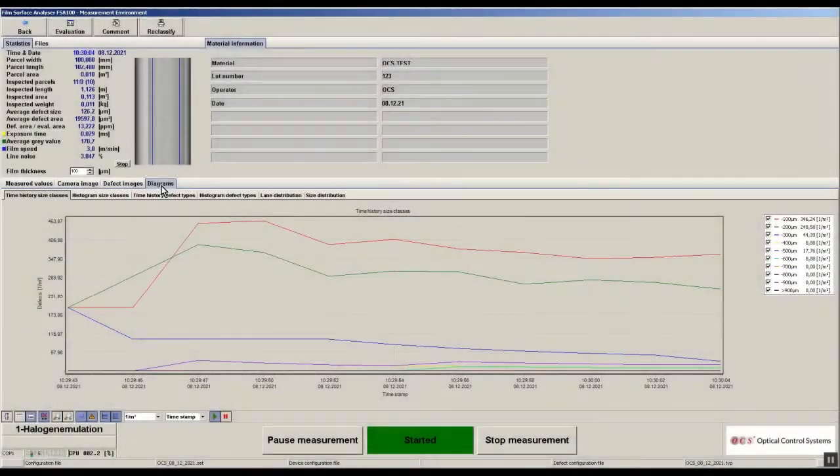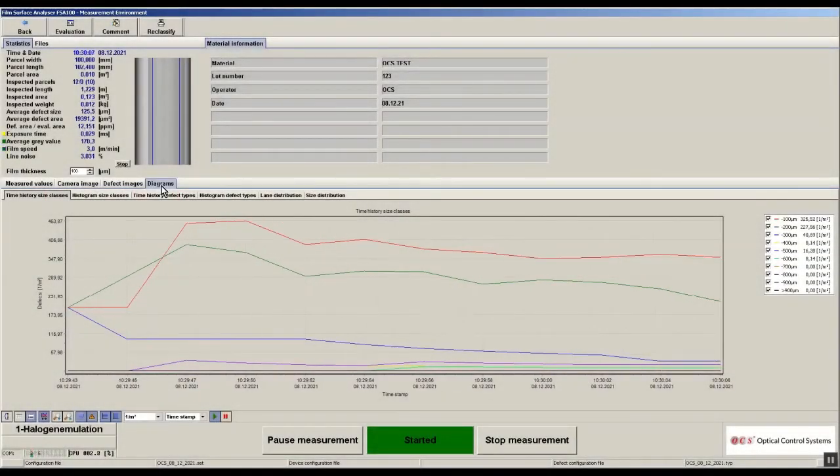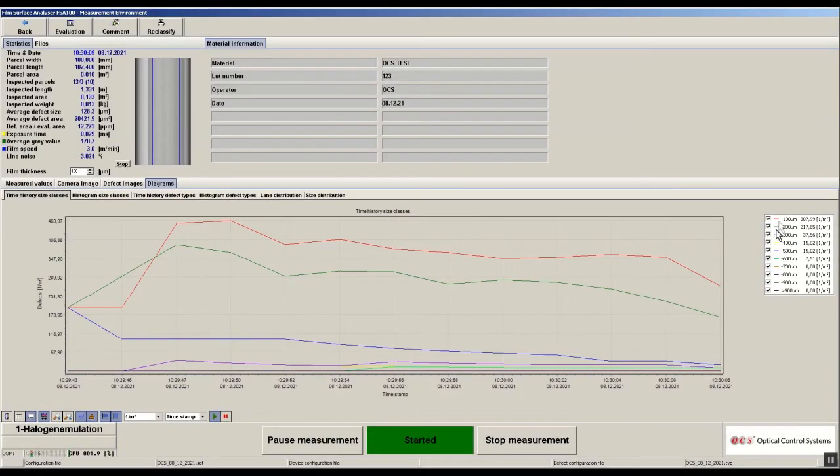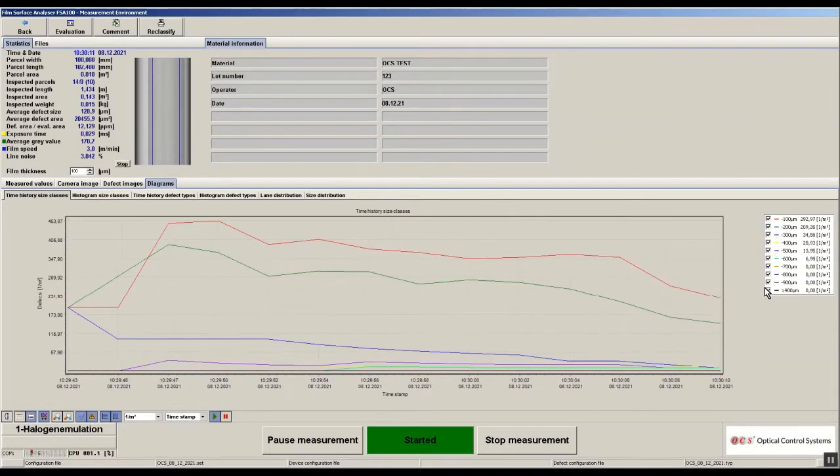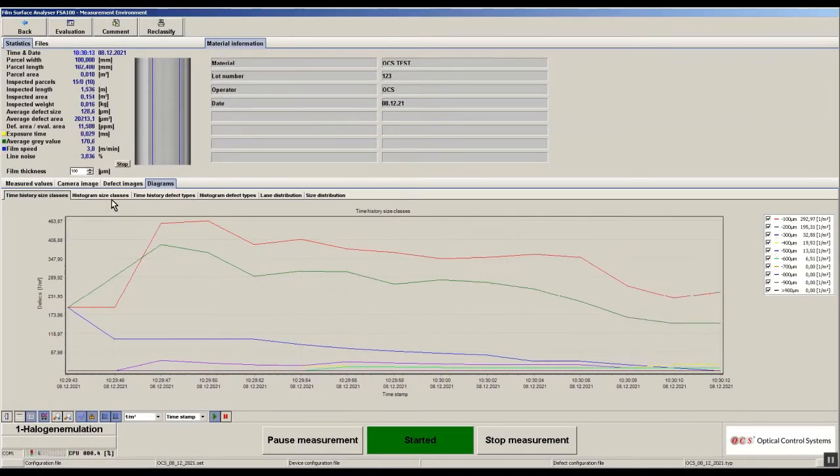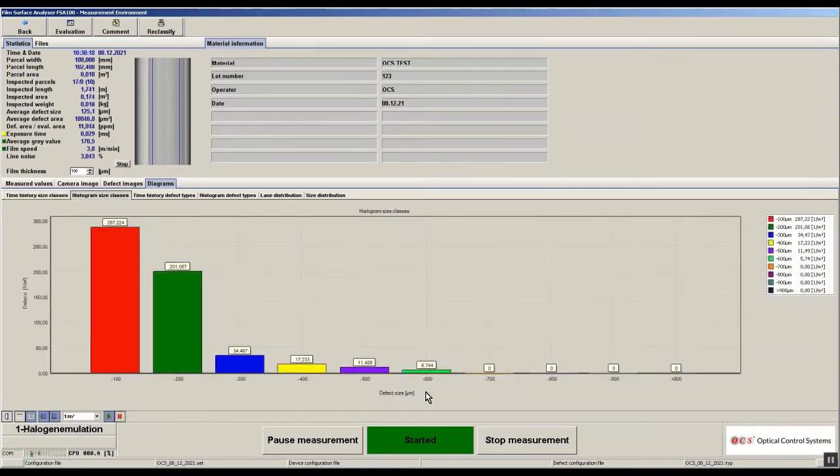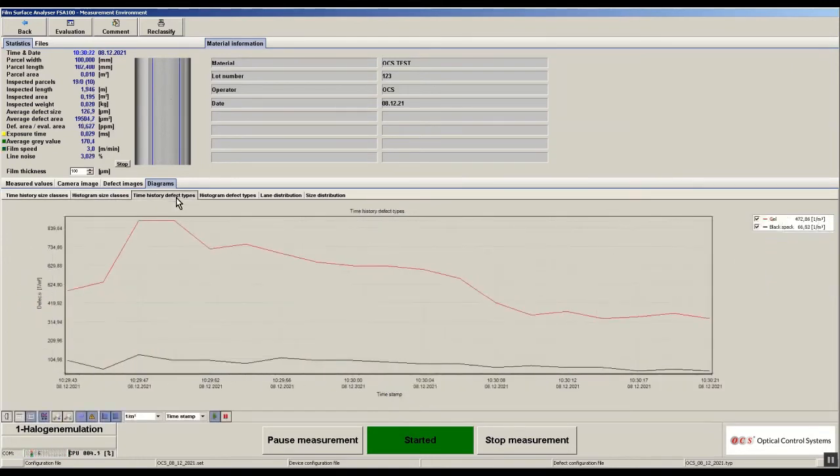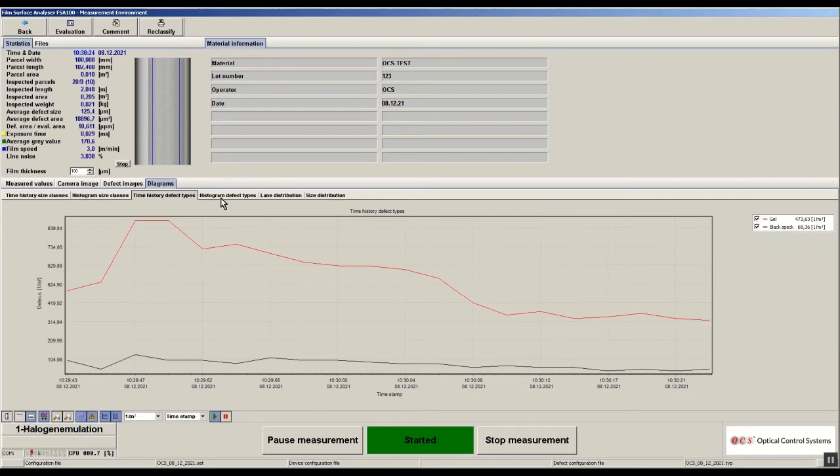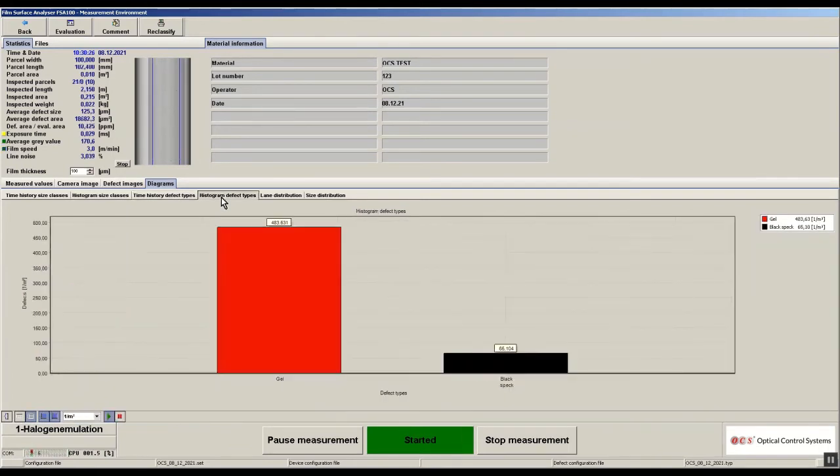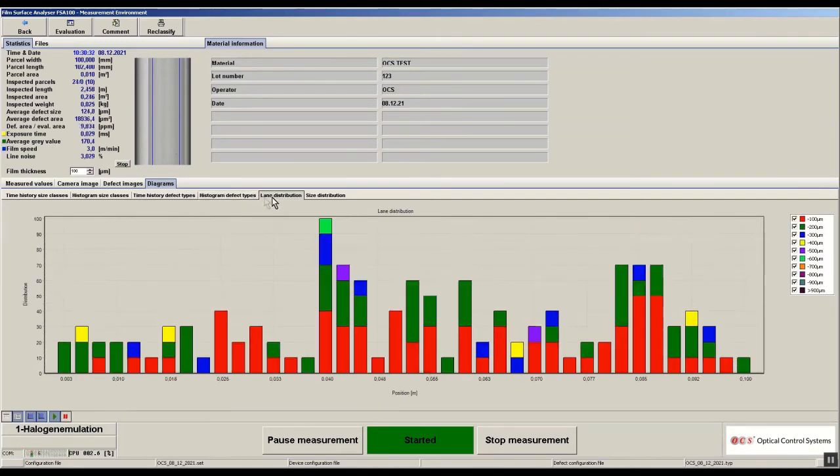During the measurement all tables and diagrams will be updated in real time. Diagrams like the time history in size classes, the histogram in size classes, the time history of the defect types, the histogram of the defect types, and also the lane distribution will give you a lot of additional information during the measurement.